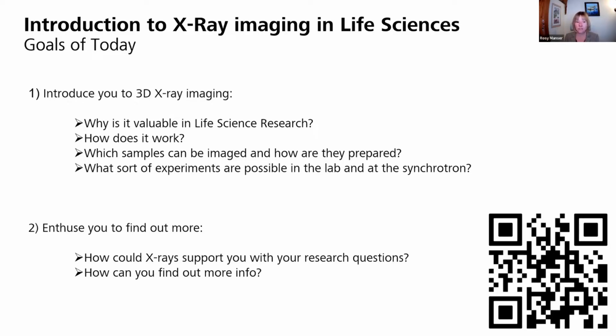We'll talk a little bit about samples, how you can prepare them, how you can contrast enhance them to get them ready for imaging using X-rays. And then delve a little bit into the kind of experiments that are possible, the different application spaces and the considerations associated with those. Liz will then talk about the similar applications that you can do at the synchrotron, or the extension of what you can achieve at the synchrotron.